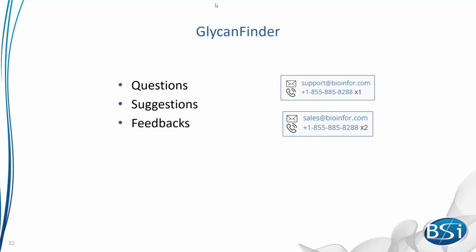Okay, so let me answer this way. So our algorithm can handle. So you mean the enriched glyco? Yeah, I mean from proteomic data. Yes, our workflows can handle both. Obviously, if it is glycoproteomics data, then you will get the better result.